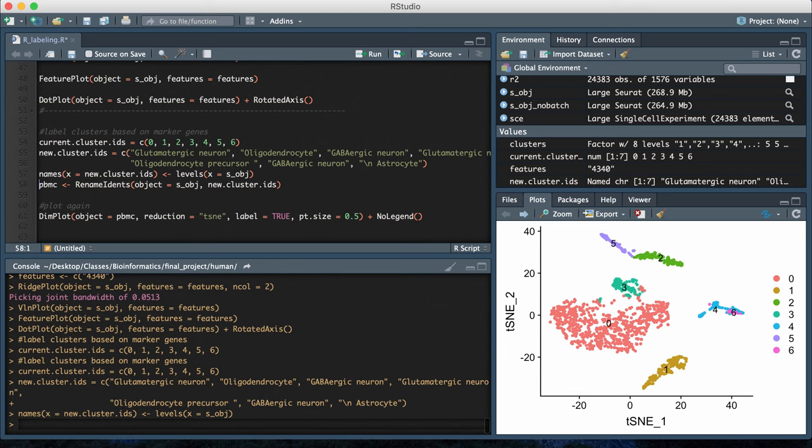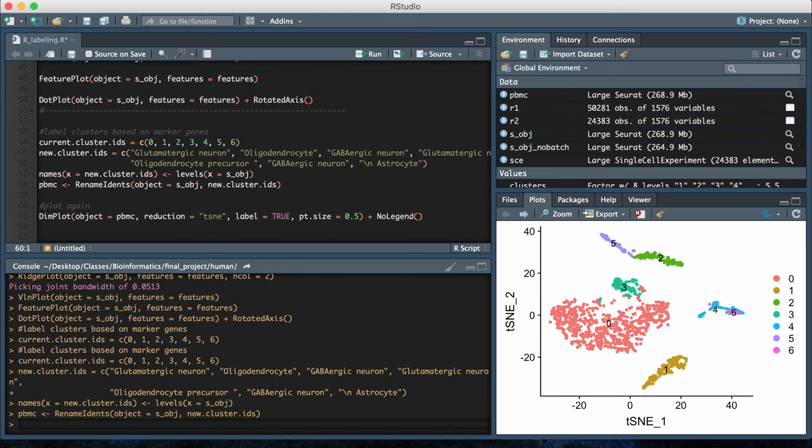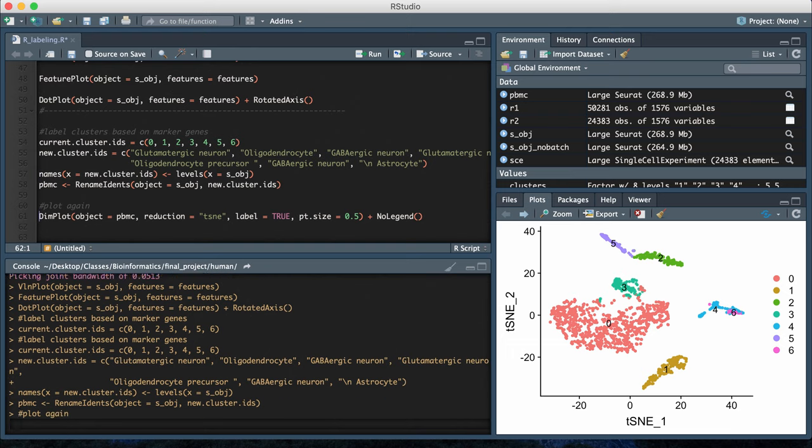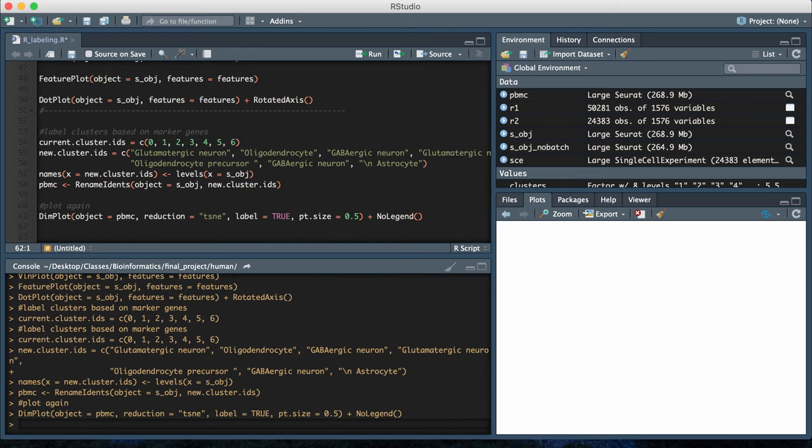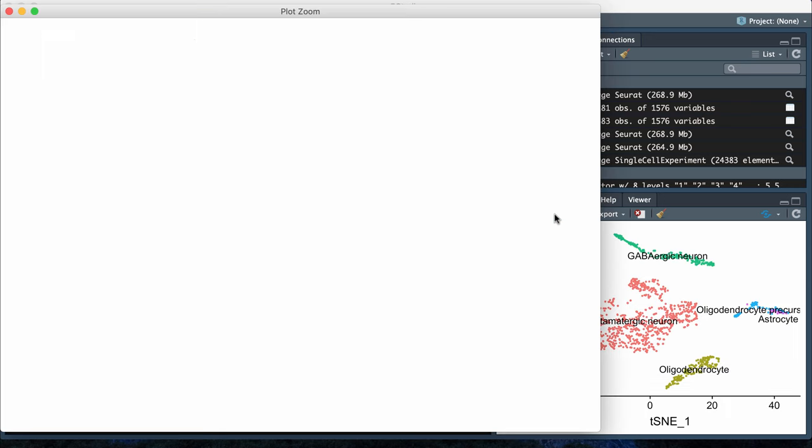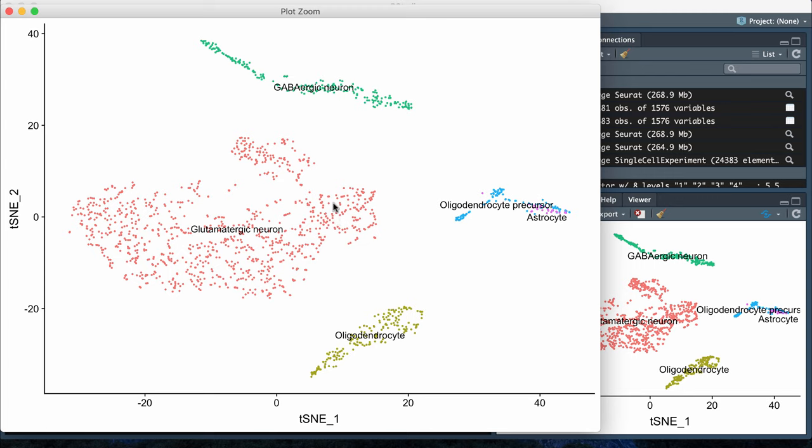Then I just add the code names and add it to my Seurat object using those two lines. Then when I replot my t-SNE plot, instead of having the clusters be labeled zero through six, we see that now these have the cell type IDs added to the t-SNE plot.